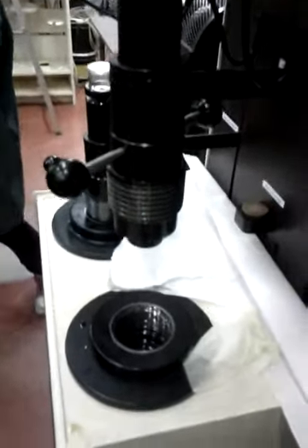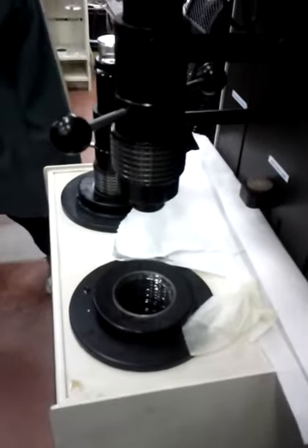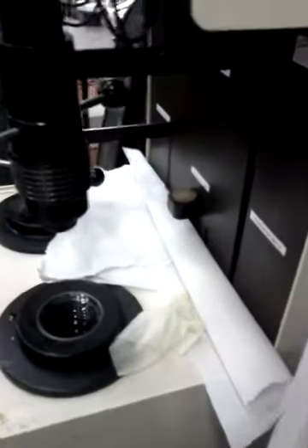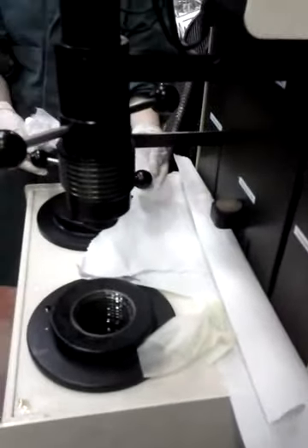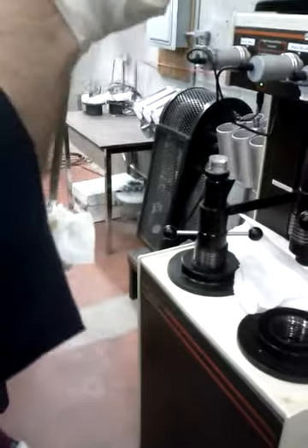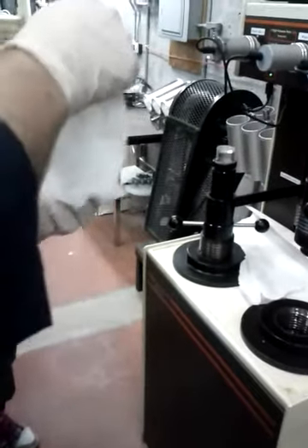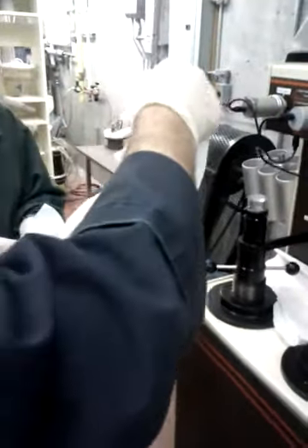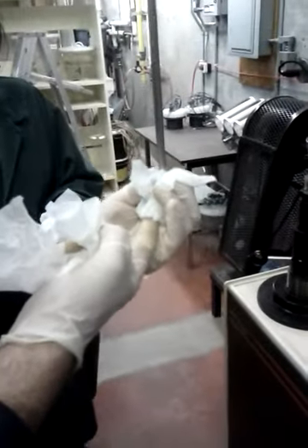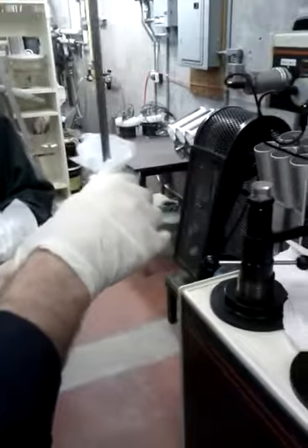We do this to clean off the oil, and with the other end to be sure that the metal part is tight. So we can just remove. Right. And now we go.